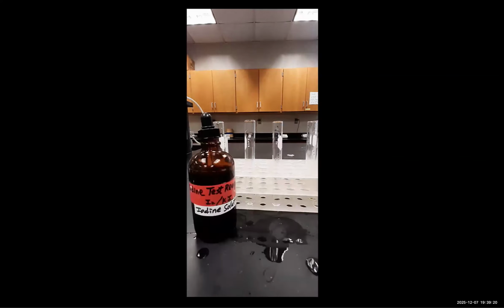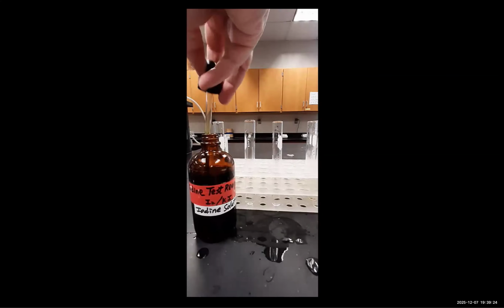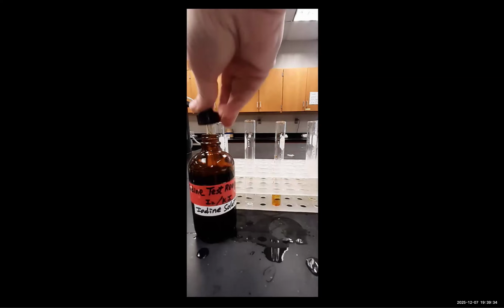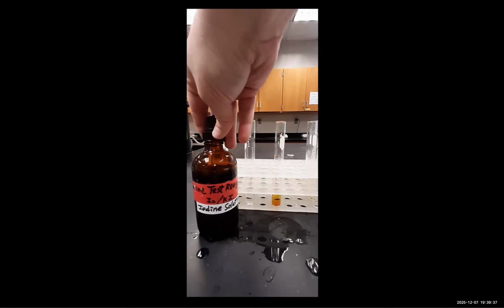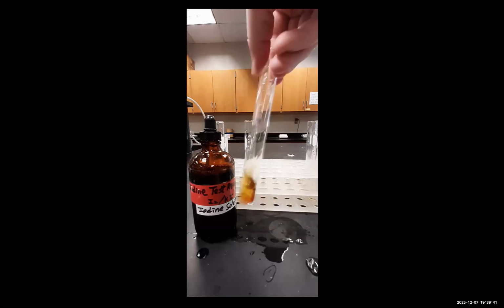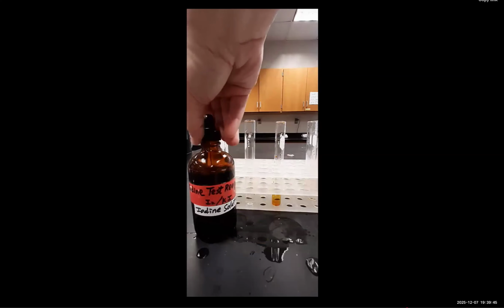Okay. Now we're going to test with iodine. And what we're testing right now is the water in the beaker. So this is the water in the beaker after 30 minutes of dialysis. So we had a positive test result for chloride.